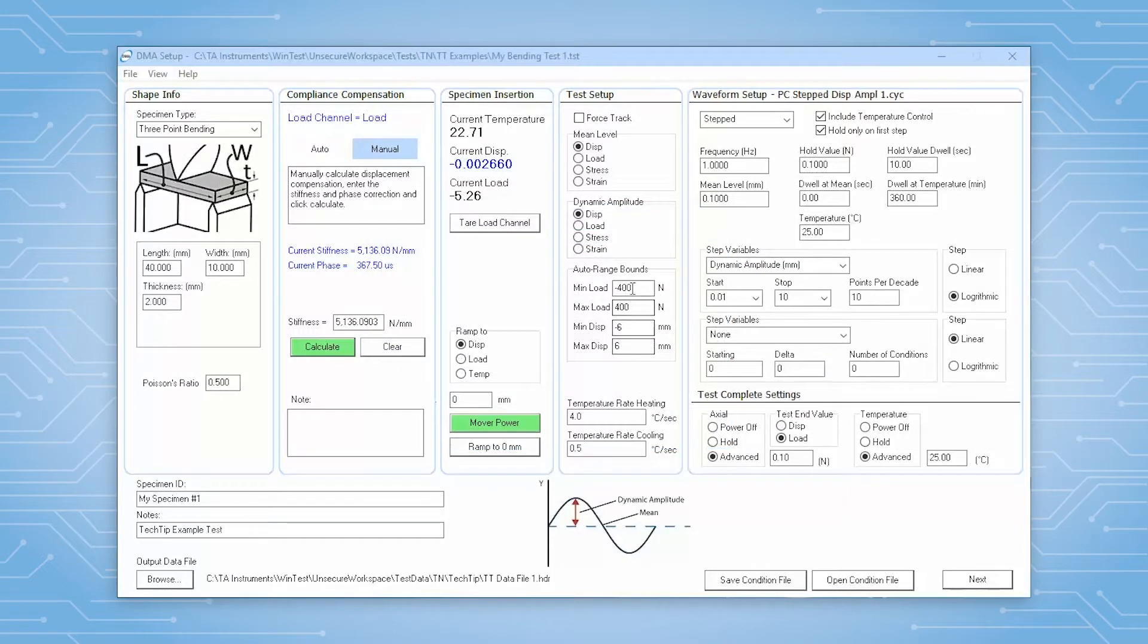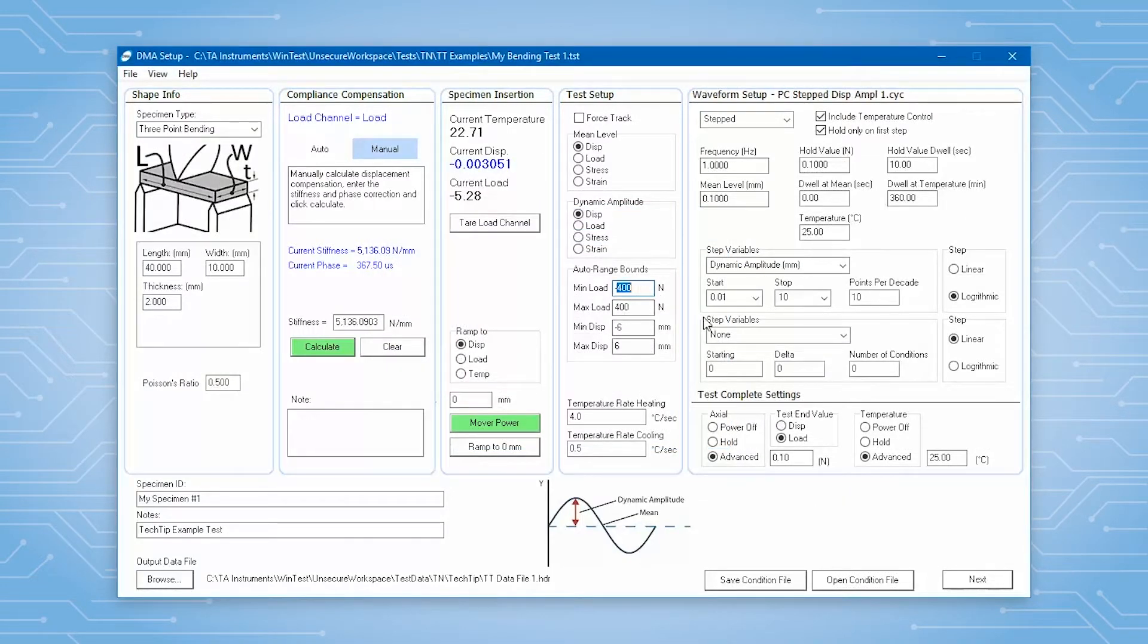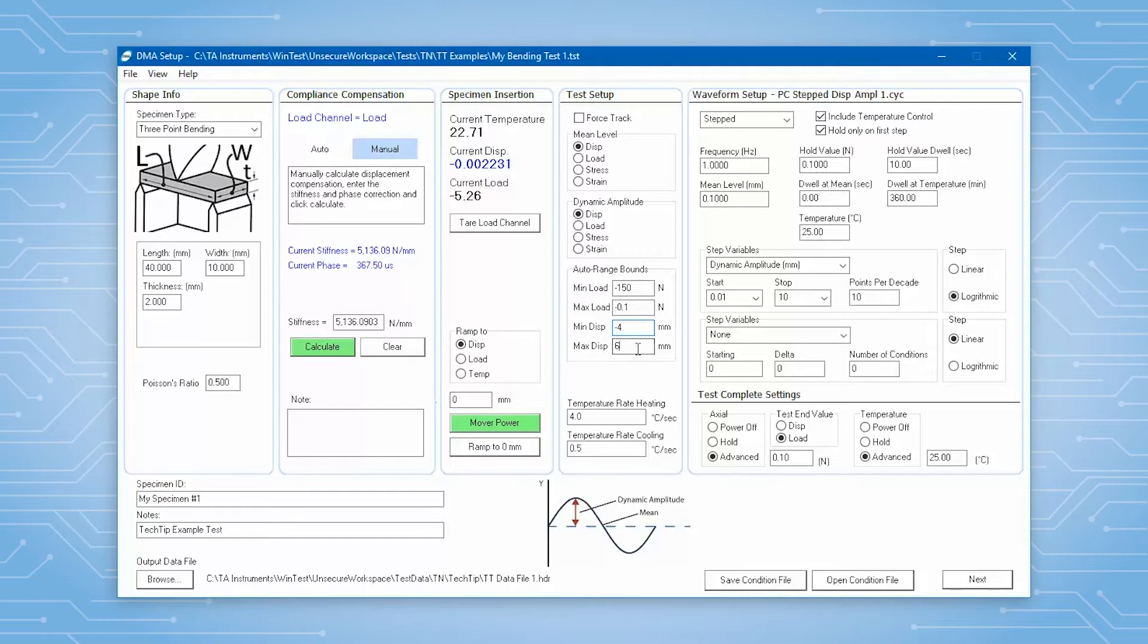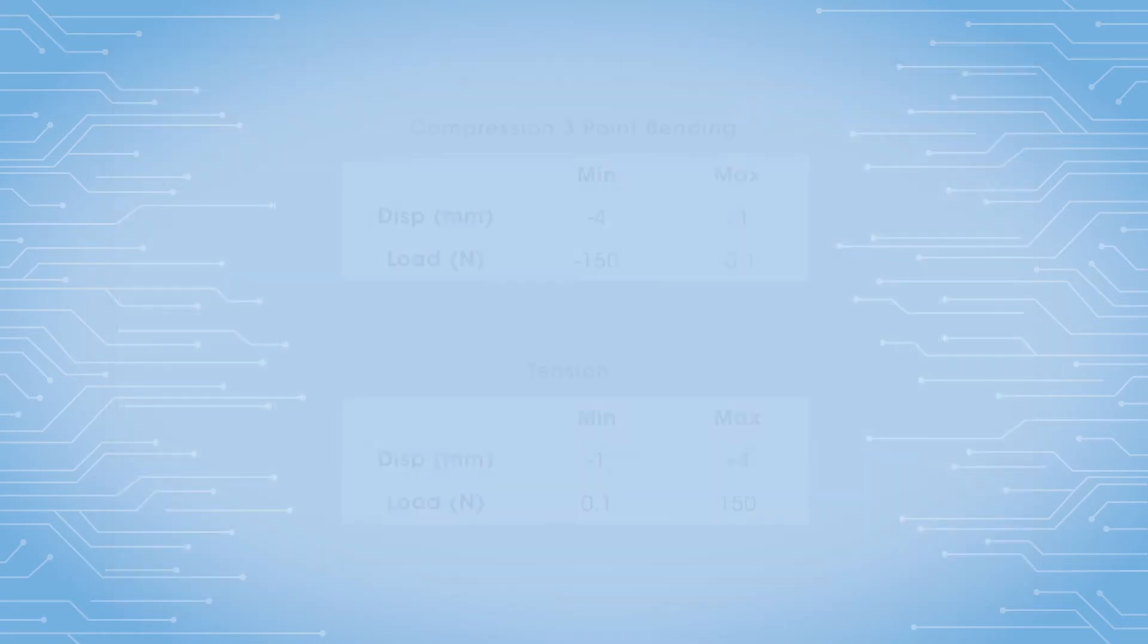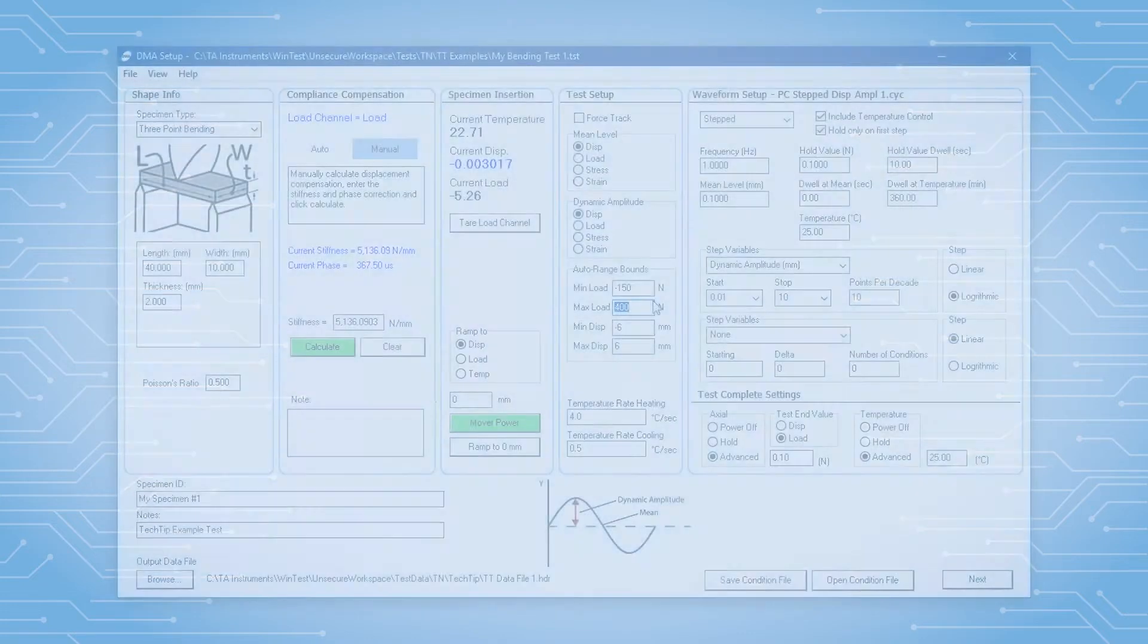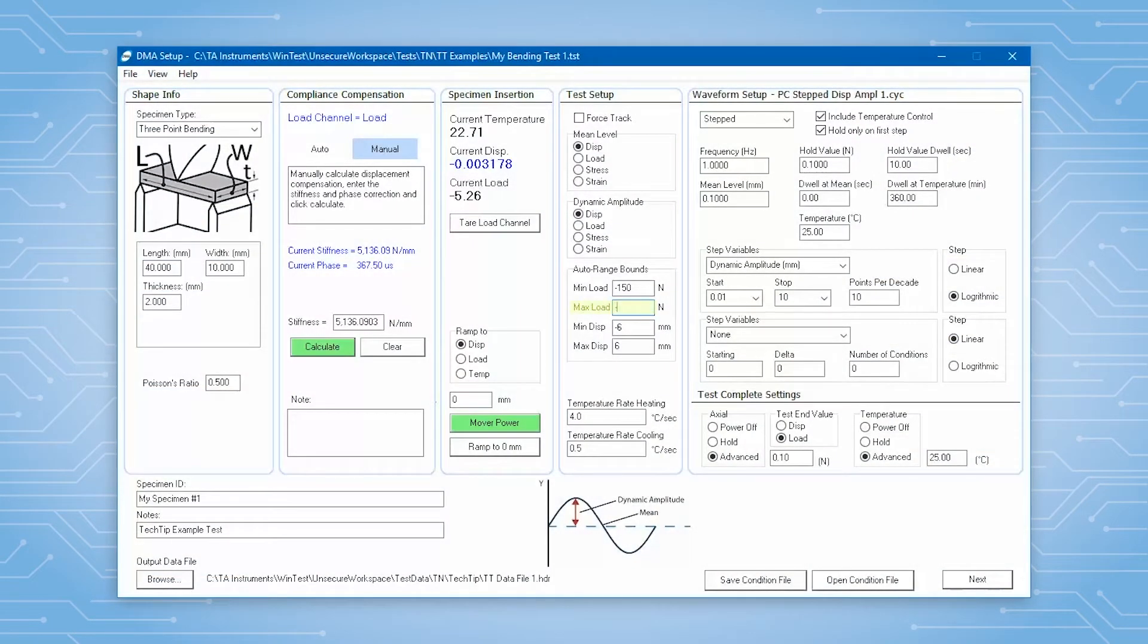You should adjust auto range bounds to fall within your limits. Another function of auto range bounds is providing an extra layer of control not to lose contact with your sample. For example, these two tables show using auto range feature to maintain a minimum preload on the sample. In the case of compression, this will ensure that fixtures do not come out of contact with the sample.